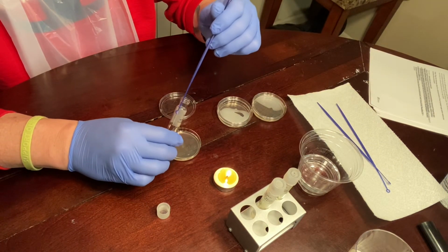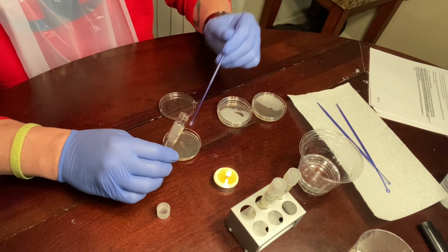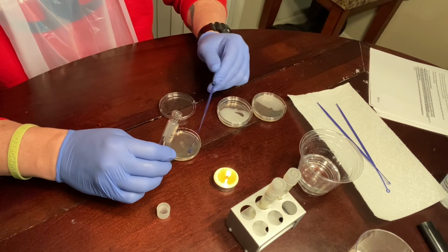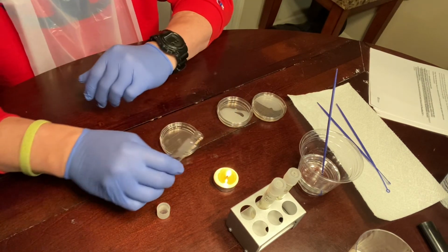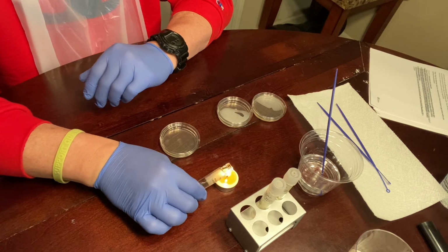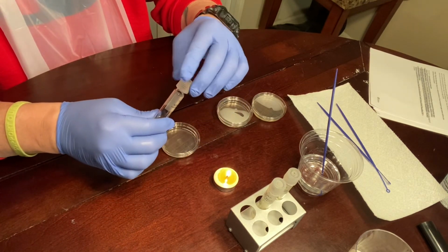Get my sample. Zigzag in the first quadrant. Sterilize. Place the lid.